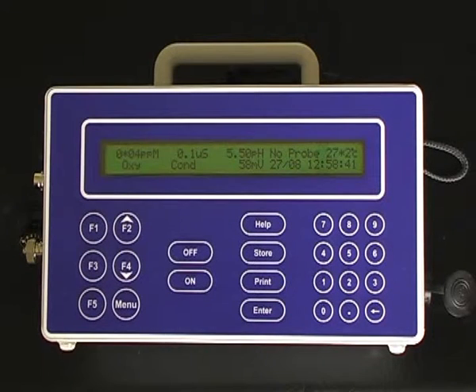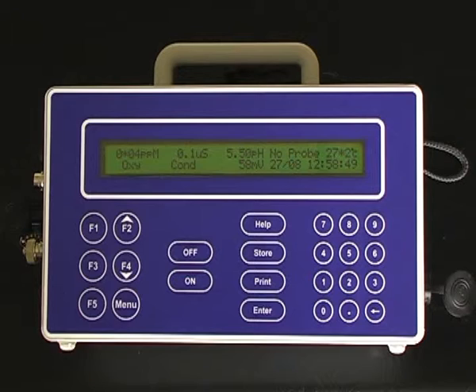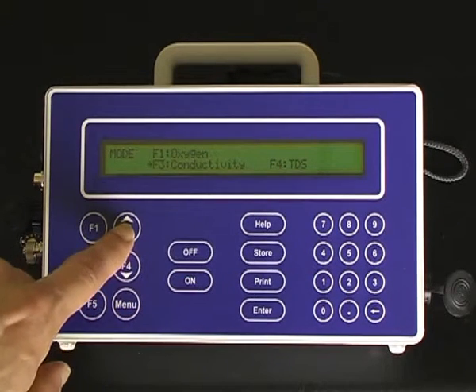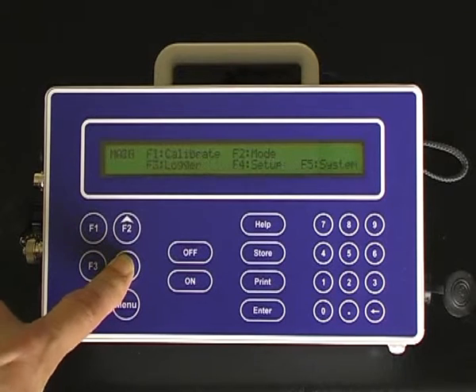To calibrate for TDS, the same conductivity sensor is used; however, the mode of the 90FLT has to be changed. Select Menu, F2 for mode, and F4 for TDS.